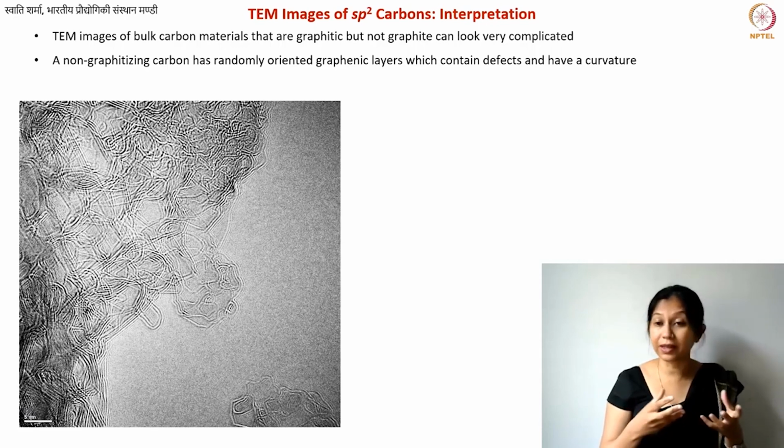When you are slicing using FIB, you may already place your sample on top of the grid inside the FIB system. This is how you analyze them. But you can also perform the heat treatment inside the transmission electron microscope, given your sample is extremely thin. In principle you should go below 20 nanometers. Why?